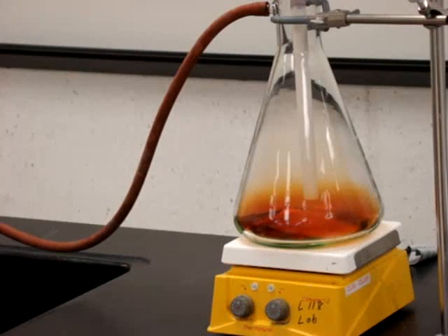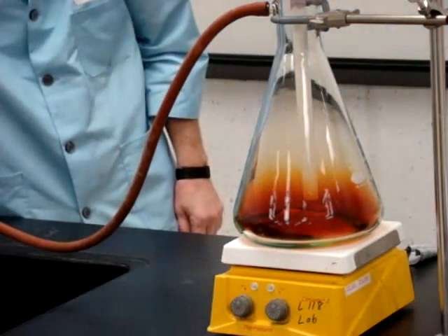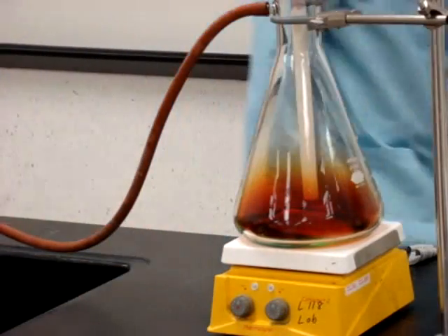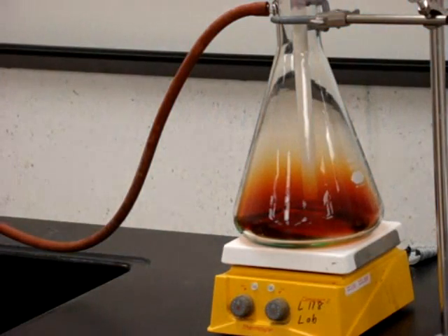I put one of them on the table, opened the bottle marked nitric acid, poured some of the liquid on the copper, and prepared to make an observation. But what was this wonderful thing which I beheld? The cent was already changed, and it was no small change either. A greenish-blue liquid foamed and fumed over the cent and over the table. The air in the neighborhood of the performance became colored dark red. A great cloud arose. This was disagreeable and suffocating.